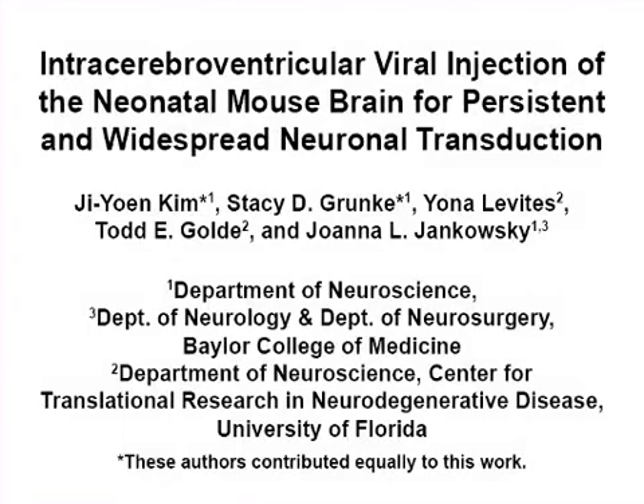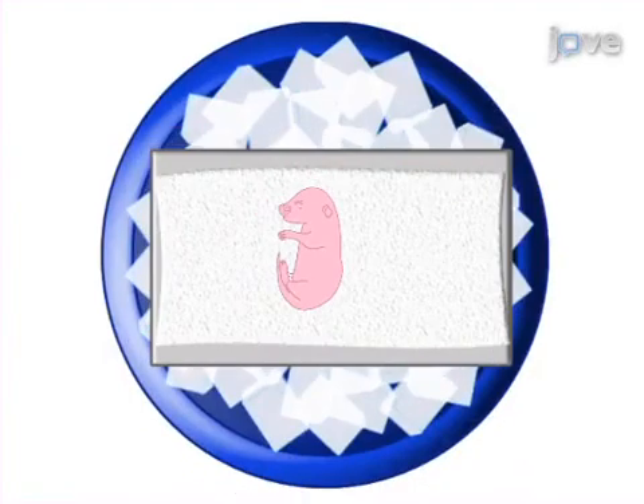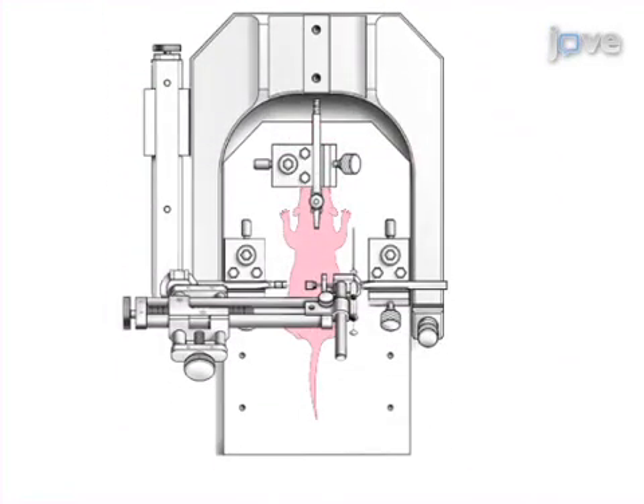The overall goal of this procedure is to virally transduce neurons throughout the brain. This is accomplished by cryo-anesthetization of newborn pups followed by transfer of the neonate to the cooled stage for injection.